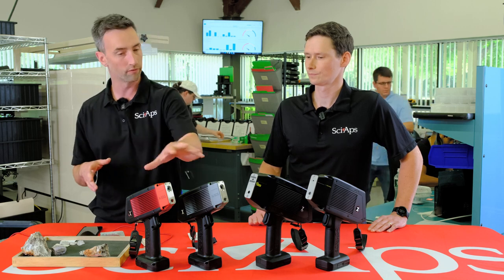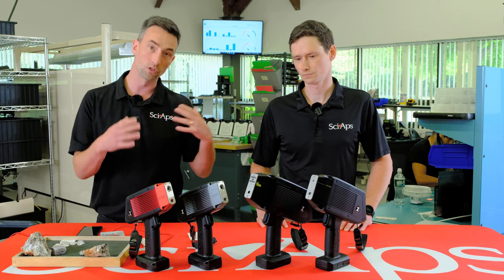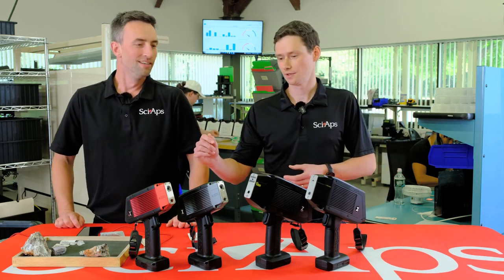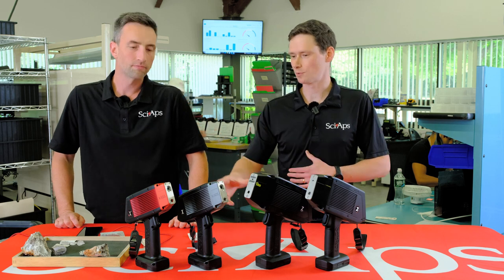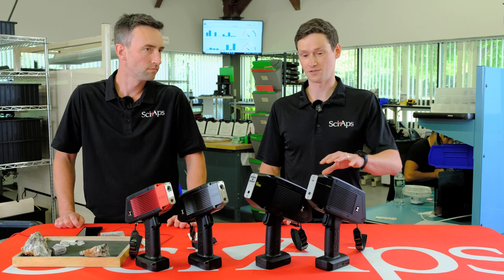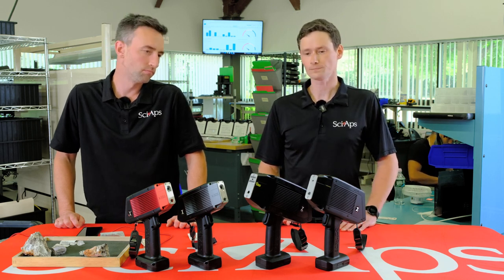It's a little bit more of a mature technology in comparison to LIBS, which is an emerging technology. I think what you're saying is this is sort of established. Lots of people probably know about XRF. Maybe less people know about LIBS. This is a little more cutting edge, maybe. Would you say that? Yeah, I'd definitely say that.